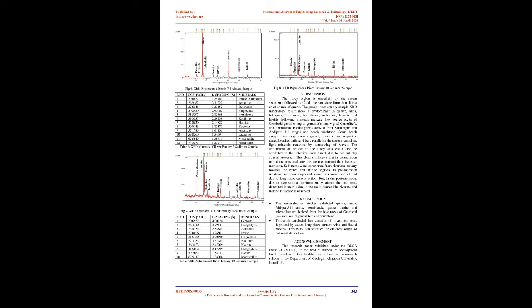The mineralogy of the Gundar River estuary and surrounding beach sediments was determined through X-ray diffraction analysis. XRD digital scan data were analyzed using Philips X'Pert. Semi-quantitative mineral percentages were determined by multiplying unique peak intensities for each mineral in a sample by relative intensity factors as described, and the products for all minerals in a sample were then summed to 100%. Intensity factors were estimated for minerals not found in the reference by utilizing values for minerals within the same mineral group.